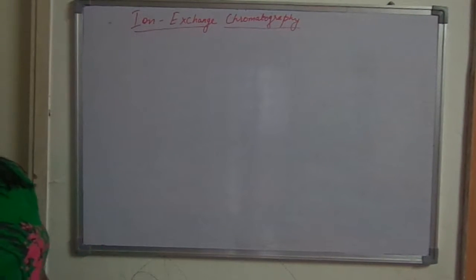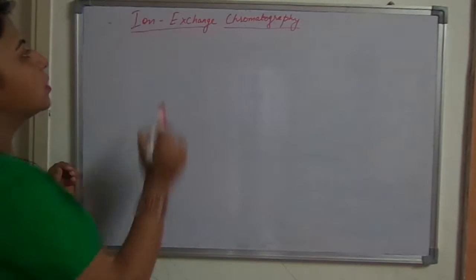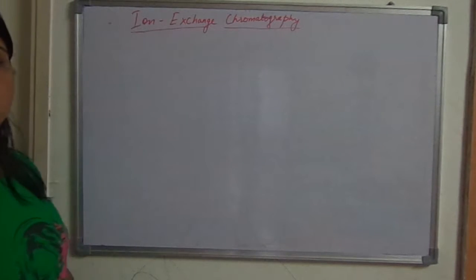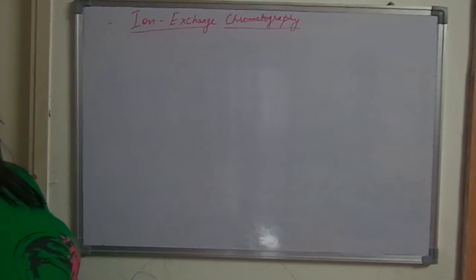Hello everyone, I am going to discuss the topic of ion exchange chromatography today. See, this technique is used in molecular biology. Ion exchange chromatography is used for the purpose of separating different ionic species.